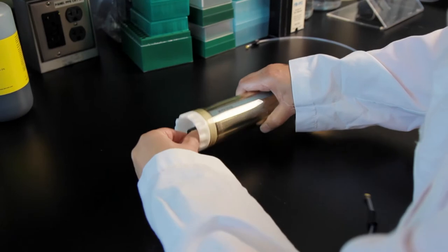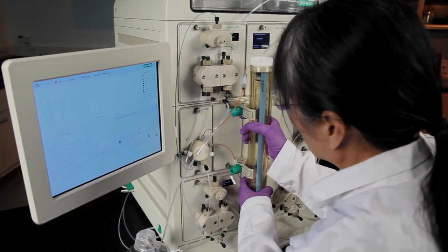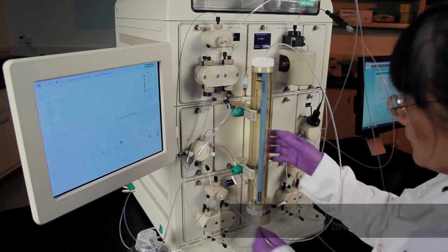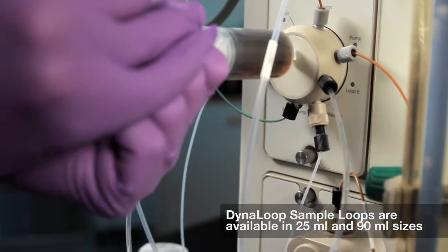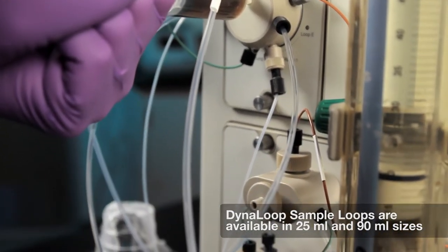Do you need to inject more than 10 mils of sample onto a column with your NGC? The Dyna Loop can make this possible. Dyna Loops are available in 25 and 90 mil sizes to easily accommodate your large volume loading needs.